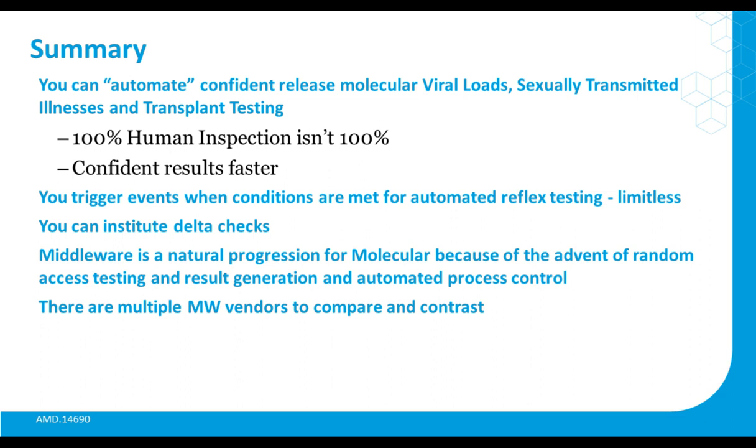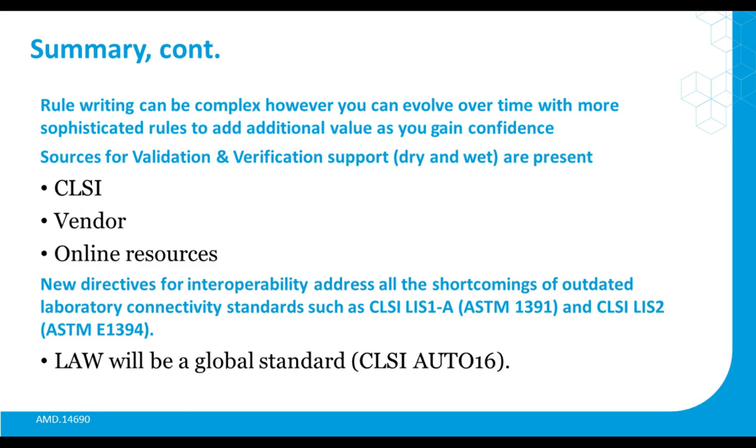And there are multiple middleware vendors out there to compare and contrast. A lot of the LIS vendors are now getting more into this space as well, and they're bringing their own solutions. Data Innovations is one I've mentioned already. I'm sure a lot of us have familiarity with them. They were the pioneers. Other sources exist out there as well. I encourage you to talk to DI and others because there's lots of opportunity for different decisions to be made.